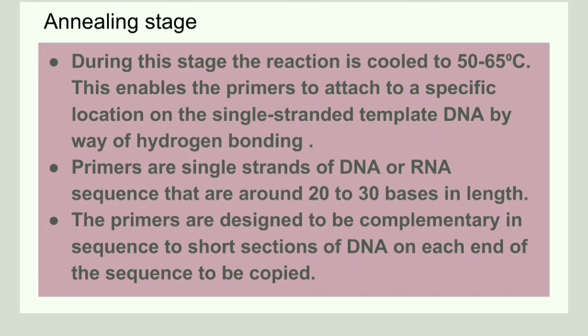Next is the annealing stage. In this stage, a temperature of 50 to 65 degrees Celsius is provided. At this temperature, the primers can attach to the single-stranded template DNA. So, at this temperature, the primers attach to the template, and this attachment is provided by hydrogen bonding.